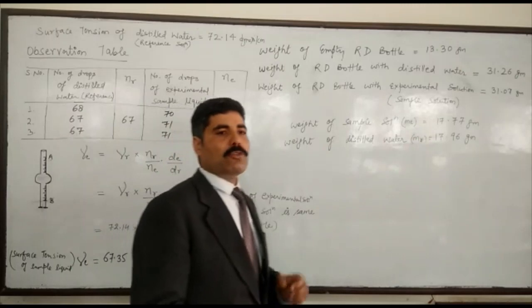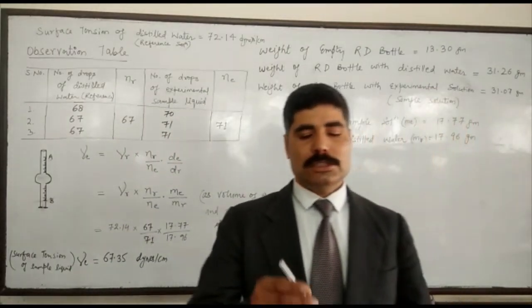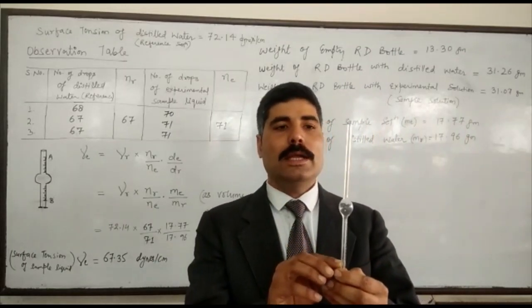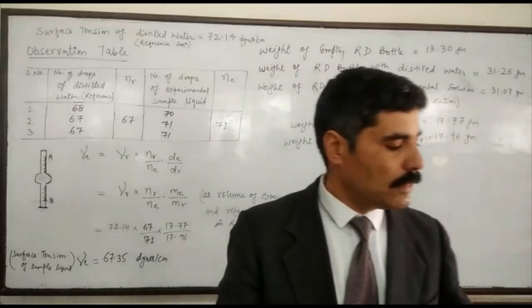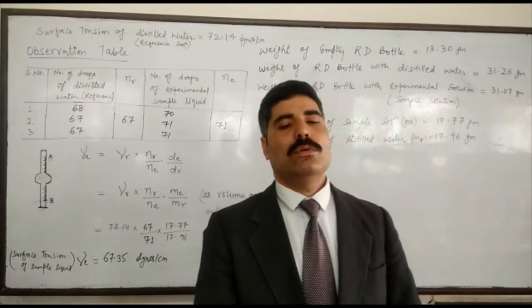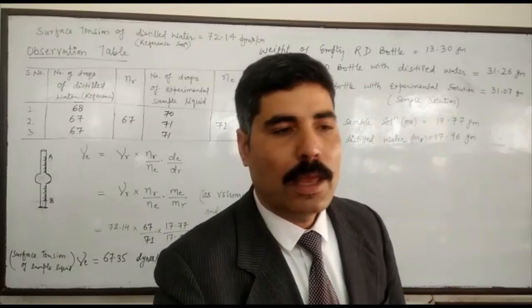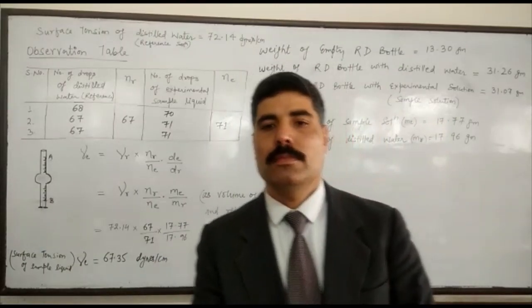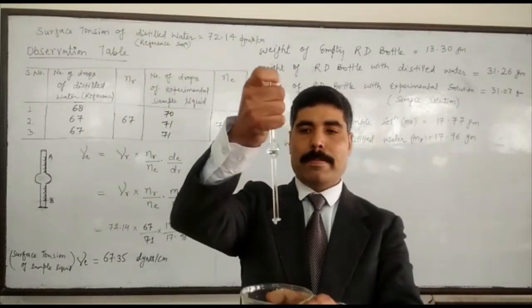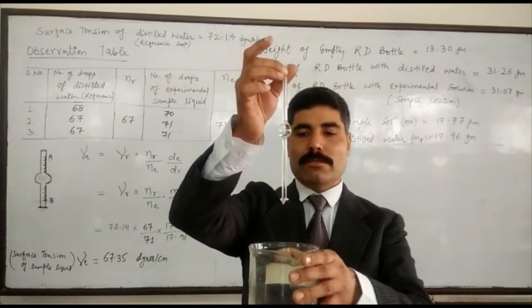Now the number of drops are calculated with the help of the stalagmometer. This is the stalagmometer with the upper mark A and lower mark B. The liquid is allowed to fall from mark A to mark B, and we count the number of drops very carefully.